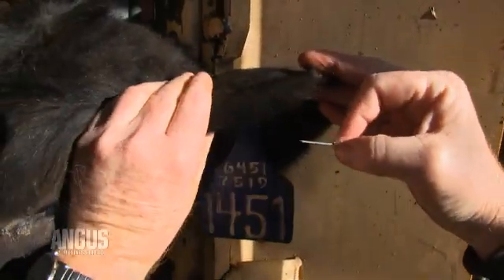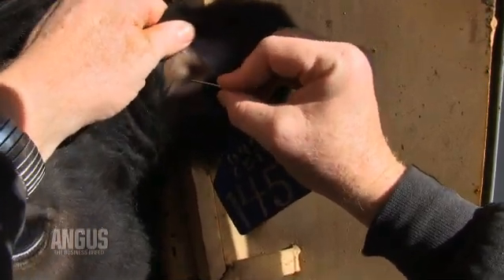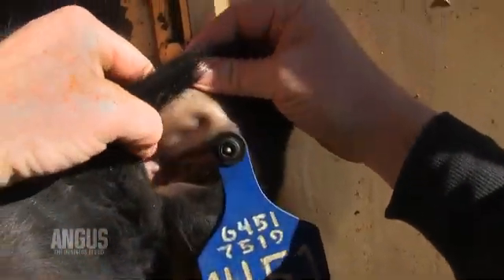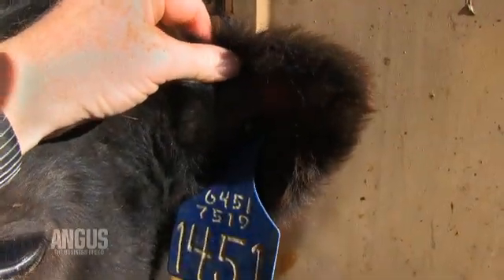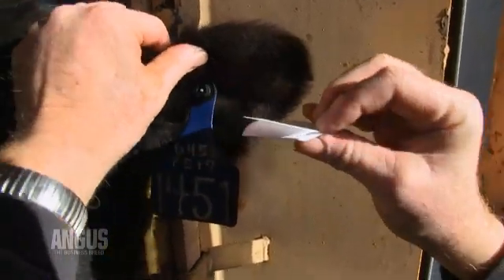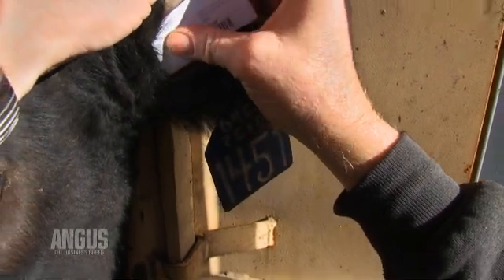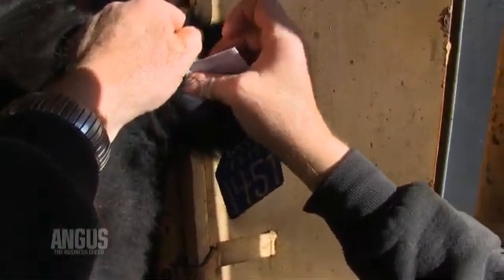I'm going to go right on the inside, as far as I can go, to prick that inside of that ear so I can get a place where the blood will well up, and then I can put it on my card. So, I'm going to go ahead and stick the heifer — it's just a nice little prick. And as you can see, the blood starts to well up. Once that blood starts to well up, I'm going to take my FTA card, fold it so I can get it in there where the blood's welled up, and stick that card right on top so that circle and that blood match up. I'm just going to hold it on there a little bit and push it in so that blood wells up. I don't want too much blood on that card, but I want to make sure I can get enough that they can get a good DNA sample punch out of that.